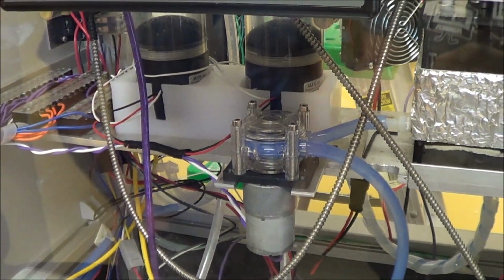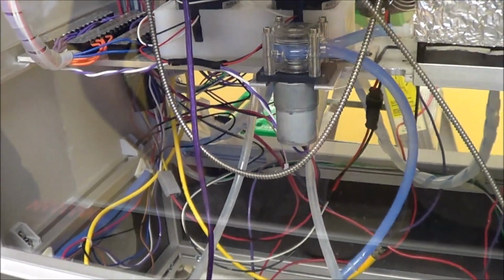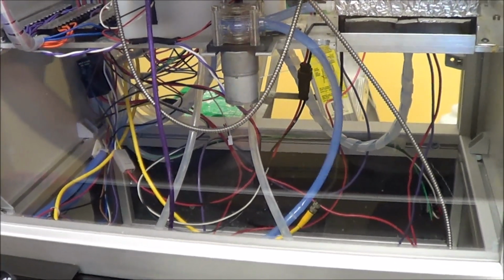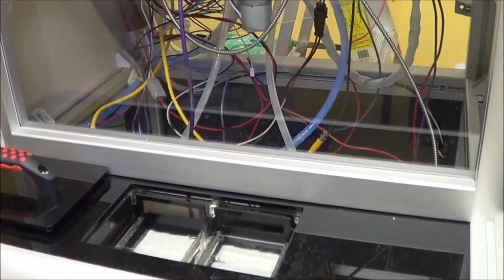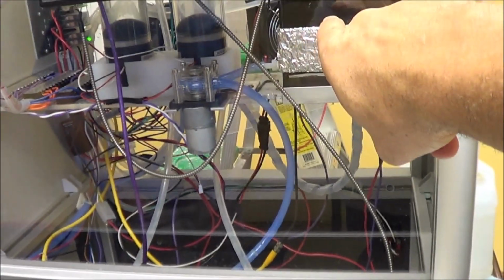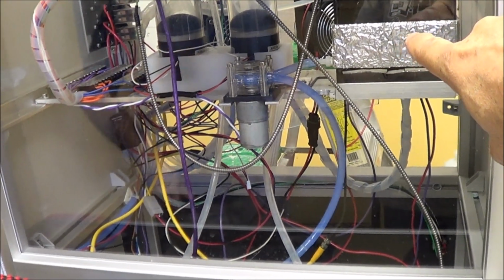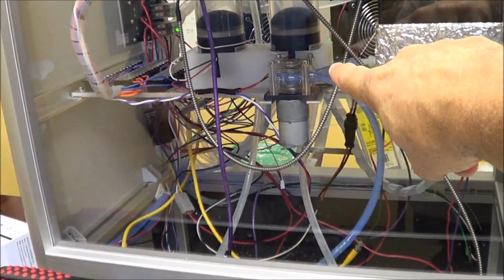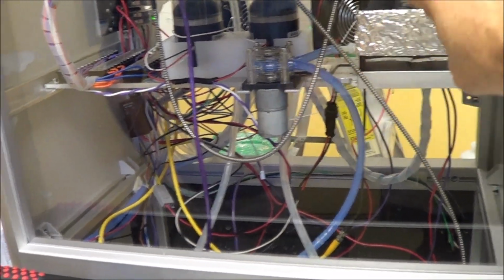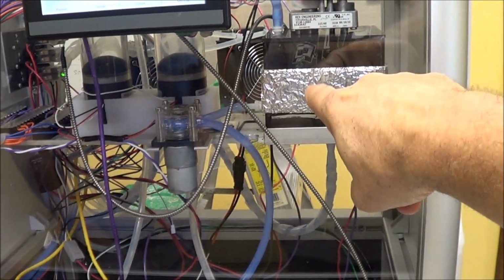So for the demo, you just set the lysis tank to half a minute, 30 seconds. Right. So once we're done with the sequence, this is going to go on. It's trying to compensate for the little rise in temperature. You've got 2 minutes on the pump to ensure that the tank's empty.